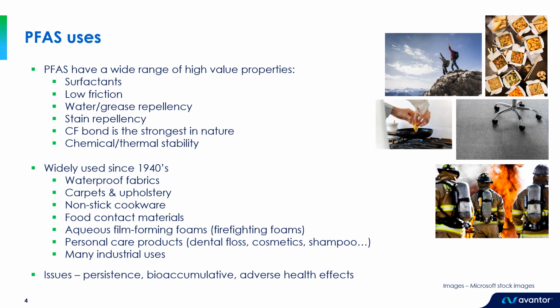Now, the key issue with PFAS is that once they've been used, they will typically find their way into the environment. Those useful properties then become a concern as they are very resistant to degradation, so they persist for long periods of time. They can also be highly mobile and have a tendency to bioaccumulate within organisms. And in more recent times, a number of adverse health effects have been linked to long-term exposure. So the widespread presence in the environment and this potential toxicity is really why we're concerned with monitoring them in the environment and various matrices.